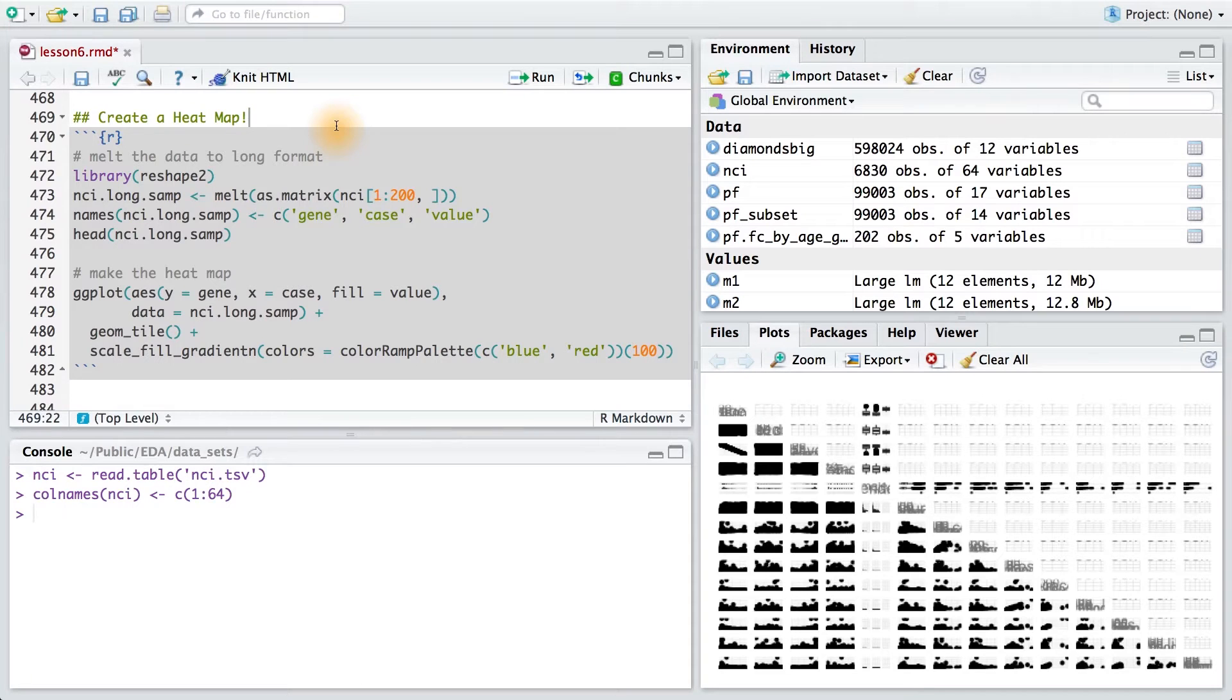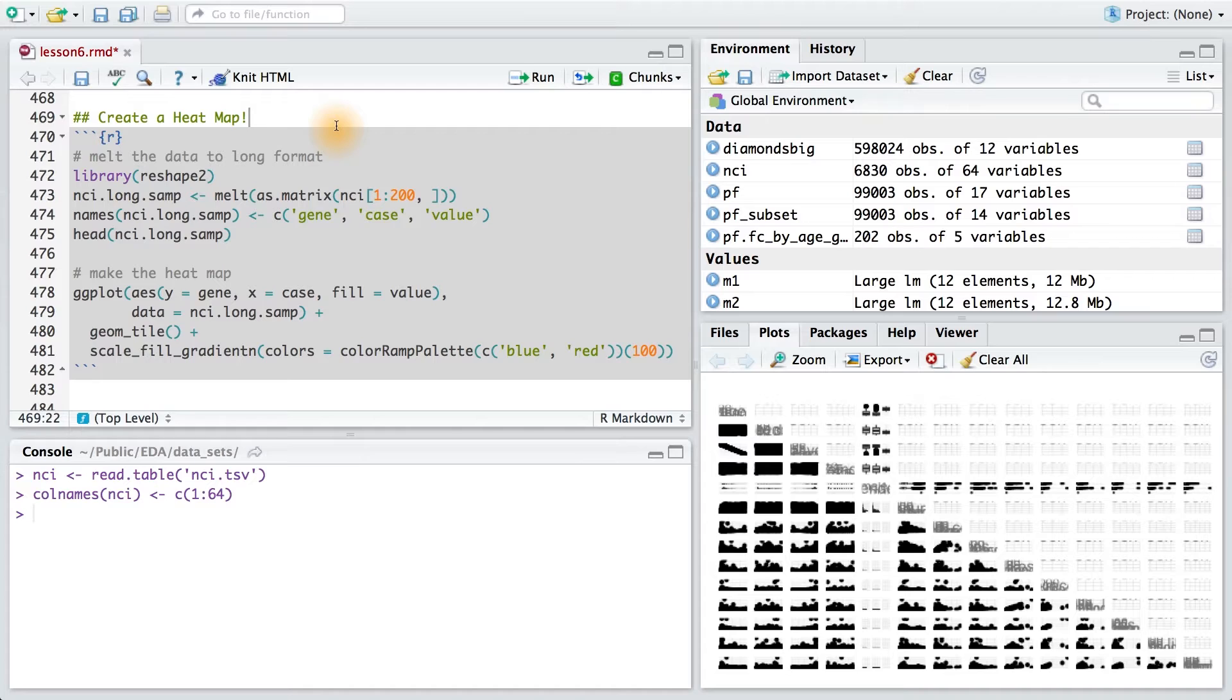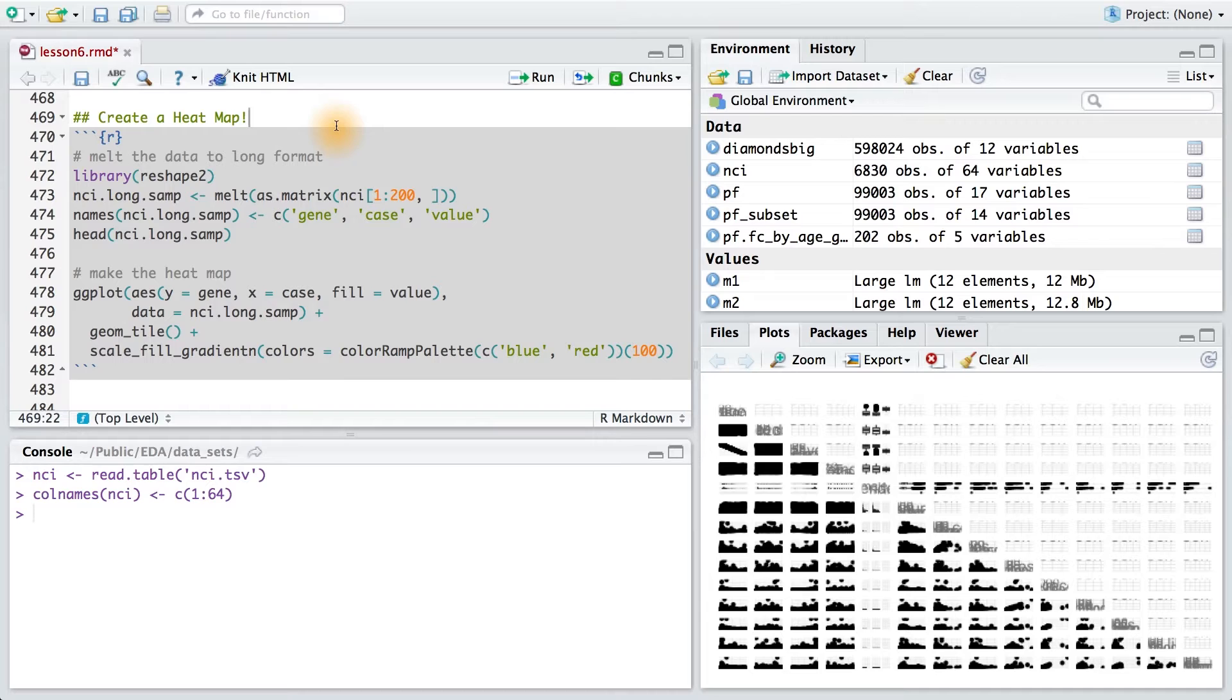The last plot that we'll make for this course is called a heat map. For our data set, we want to display each combination of gene and sample case, the difference in gene expression in the sample from the baseline. We want to display combinations where a gene is over expressed in red, and combinations where it is under expressed in blue.